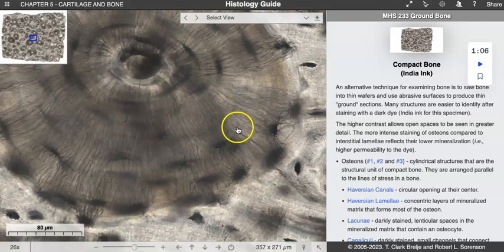It's not living, but the cells are living. And how do they stay alive when they're basically cemented in bone matrix? We can't just cement them in, or they would die off. And so we have to be able to have some sort of molecular flow here, and these canaliculi allow for those channels to exist. And then the cells themselves actually do have cytoplasmic extensions that extend into the canaliculi, which is kind of amazing, really.